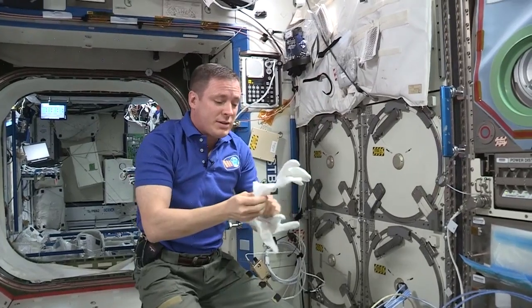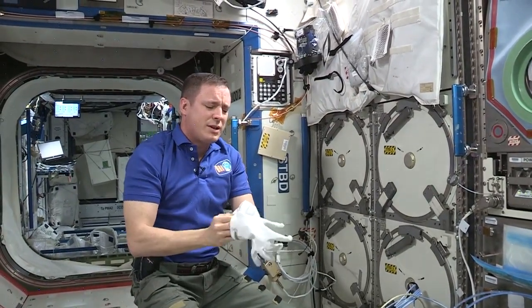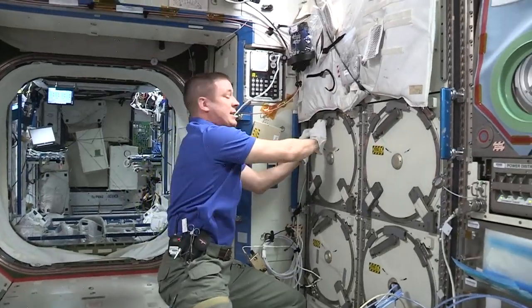It's so cold we have to wear these fashionable white gloves. Do you remember in A Christmas Story where he stuck his tongue to the flagpole? That's pretty much how it is if you put your hand on one of these.